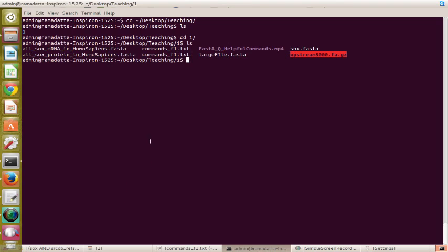Okay, the first thing, let me tell you: when I downloaded from the RefSeq database, the sequences were not zipped, but sometimes you might get files from different sources where they zip the file because they have a size constraint. So they give you the FASTA files in this format, zipped. One thing to mention is that sometimes the fasta has the extension .fasta, sometimes only .fa, and sometimes they also zip it, and the file name becomes .fasta.gz. The convention might be a little different, but they still represent the basic format that is called a fasta file.